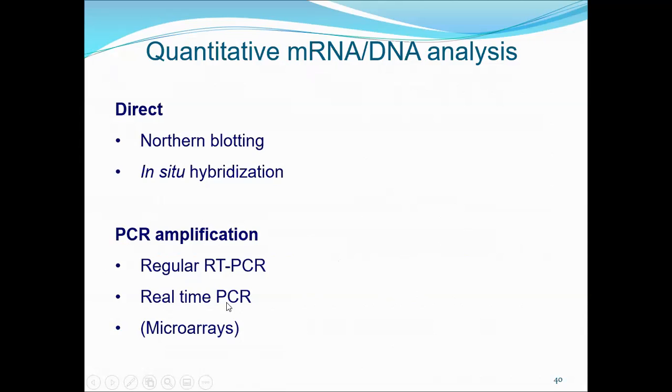Then you have the real-time PCR for the amplification, and also you have the microarrays, which are the miniature real-time PCRs, and those are present in the chips. So it is easier to perform multiple samples in one shot.